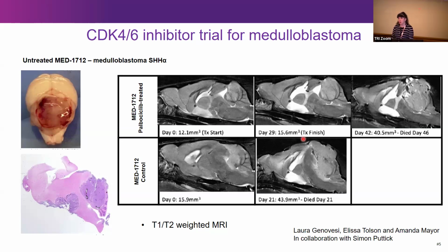And on the other side, although IVIS gives you a good indication of the tumor growth and response to the treatment regression, you still cannot accurately determine the volume, the structure, where it's growing, etc. Because we now have a lot of these tumors growing in the cerebellum, but we're also working with gliomas and tumors that grow in the pons or the cortex as well.